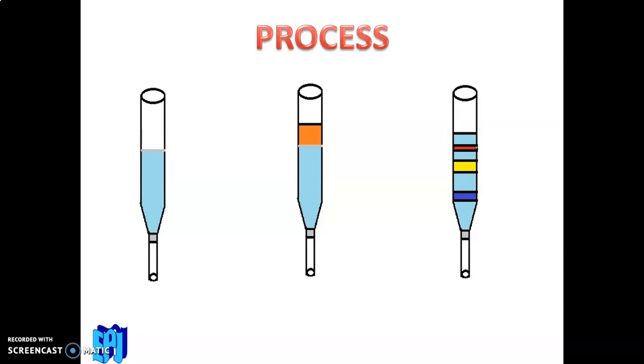Then when you pass the mobile phase through this, the components get penetrated, and we have to collect the components in separate beakers.